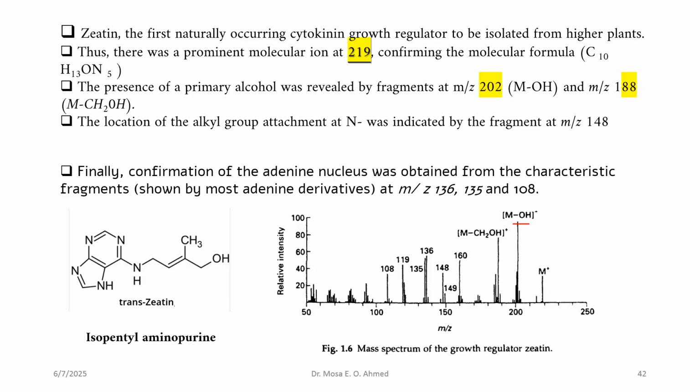In this slide, another example of a naturally occurring compound whose structure can be elucidated by mass spectrometer.